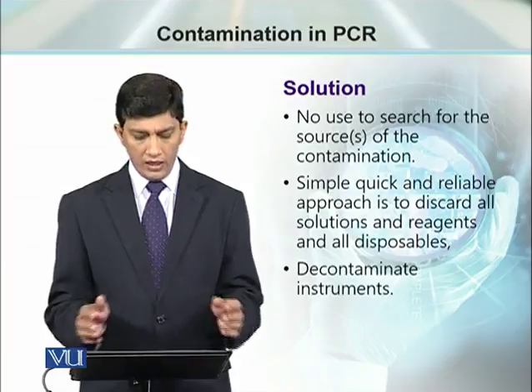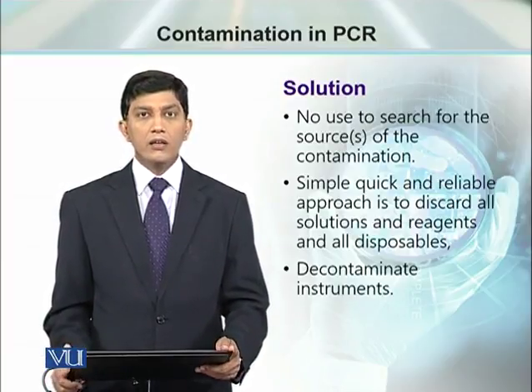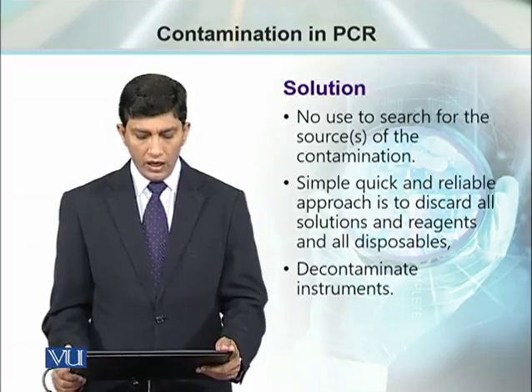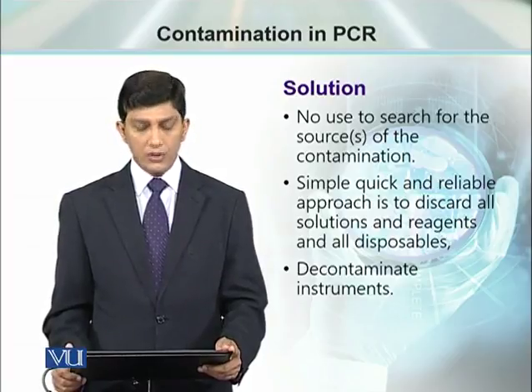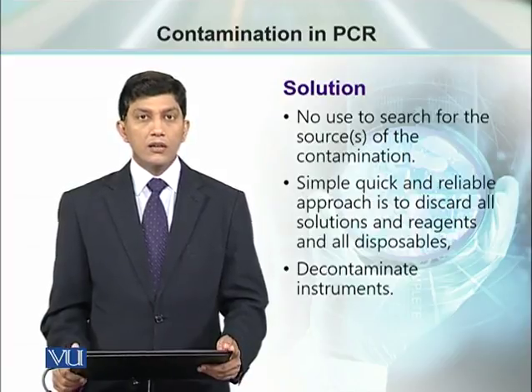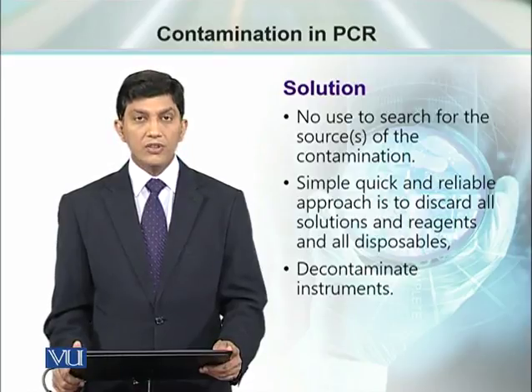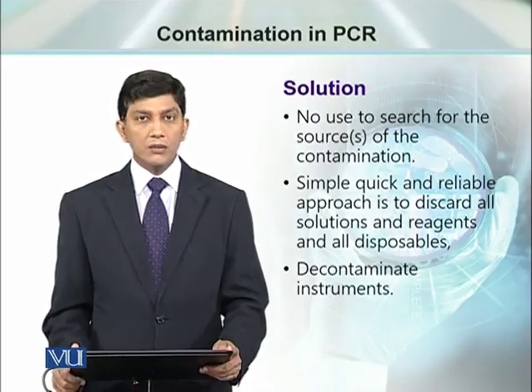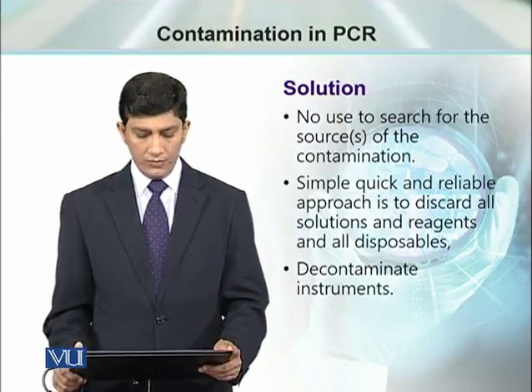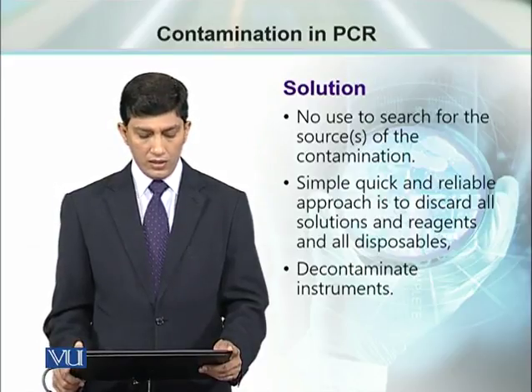The best idea is to discard all the consumables and prepare new solutions and reagents which are clear and pure from contaminations. Besides, try to decontaminate the instruments which you are going to use for PCR reactions.